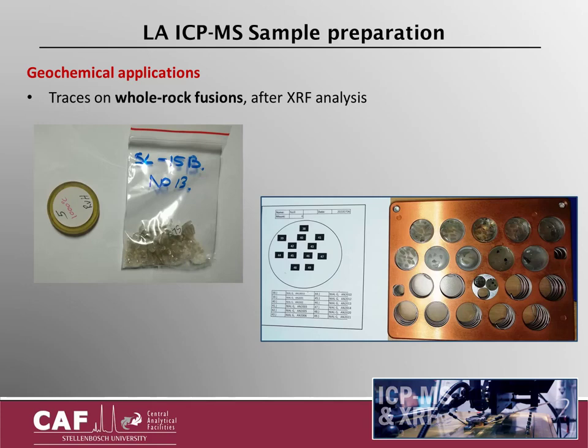After the XRF analysis is completed, the fused bead is crushed into small chips. These chips are carefully selected and molded into an epoxy mount. The mount is then placed in a secure sample holder to perform the laser ablation.